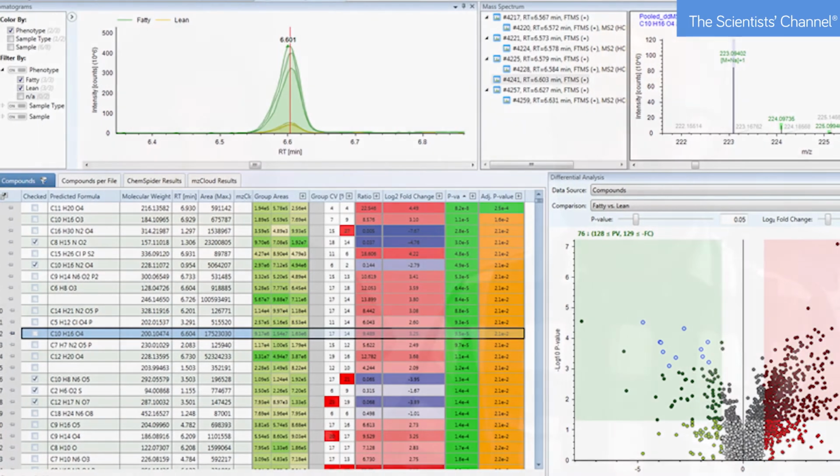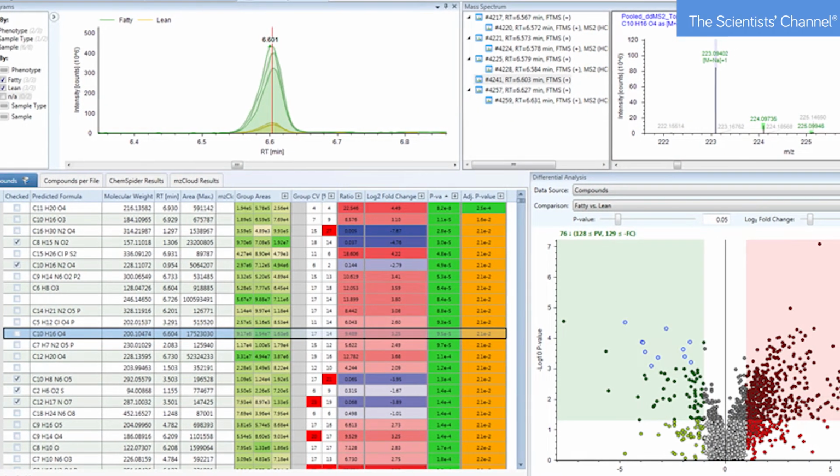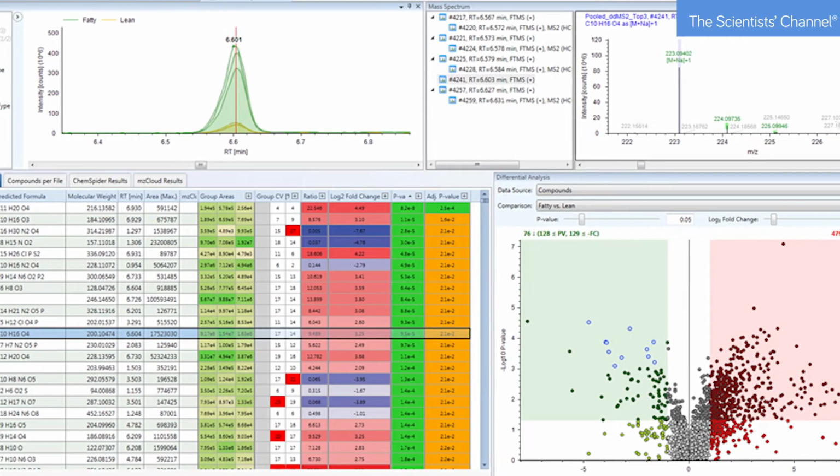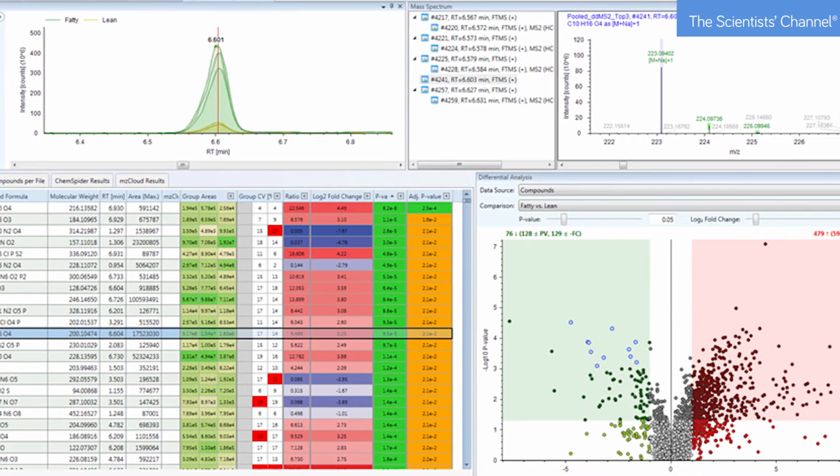Since I'm trying to find the effect of the changes during the method development, the good thing about CD layouts is that the results are always directly linked to the raw data. The results can be further reduced by filtering sections on volcano plots, PCA, PLS, that are interactive and updated in real time.